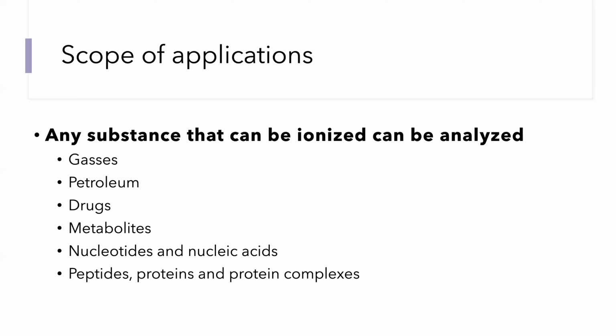Mass spectrometry is the most powerful method for analyzing proteins, their modifications, such as phosphorylation and glycosylation, and their interactions, such as the binding between proteins to form protein complexes. Because proteins are large macromolecules that don't ionize very easily, it is frequently convenient to start by digesting them into peptides and then analyzing the peptides by mass spectrometry, something of which I'm going to give more examples later in the course of these lectures.